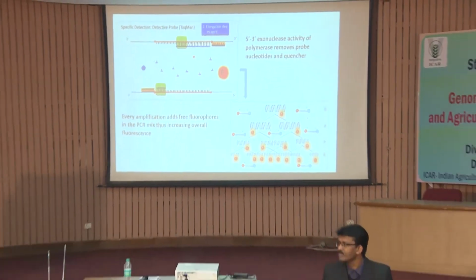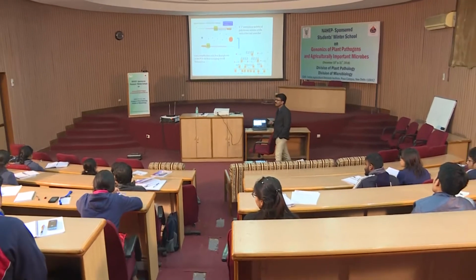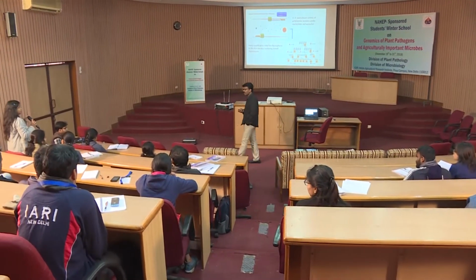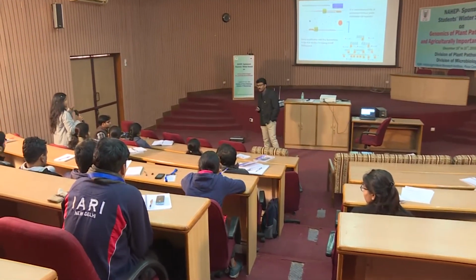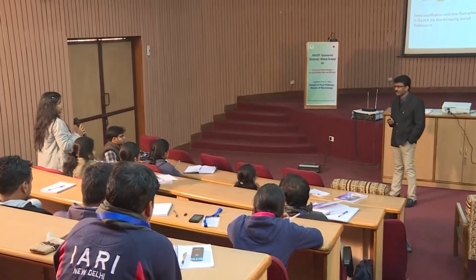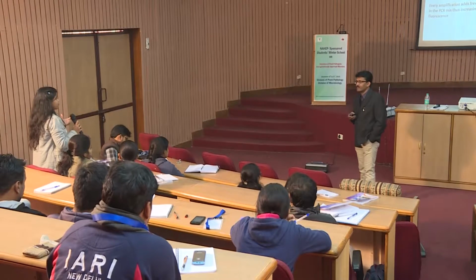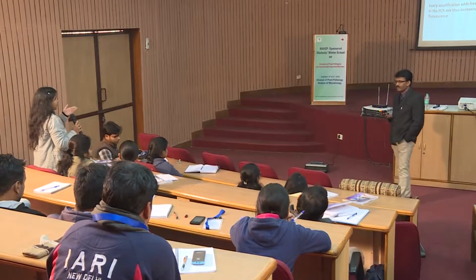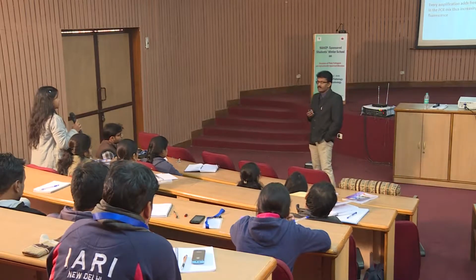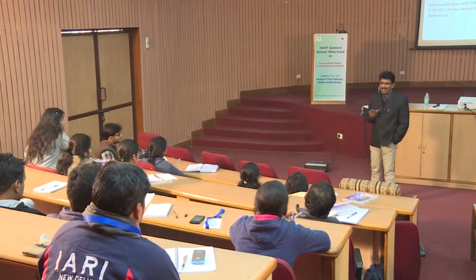Sir, there is also a possibility when annealing happens, that primer and probe are binding simultaneously. There is also a chance that sometimes the primer may bind, but in that particular region the probe may not bind, but that product will get amplified. But only fluorescence will get counted, so that product is already amplified but not detected. So is it? It might happen. We see that kind of mistake might happen definitely.